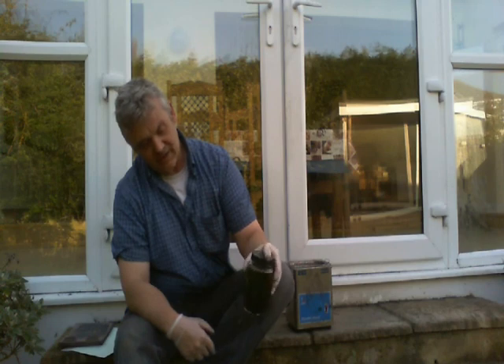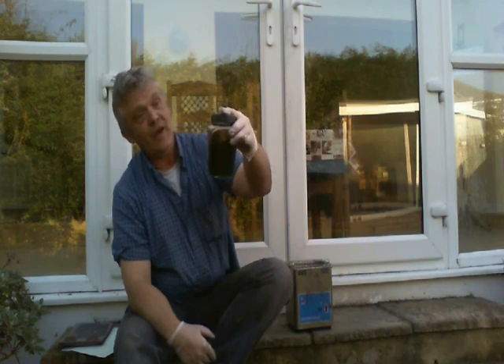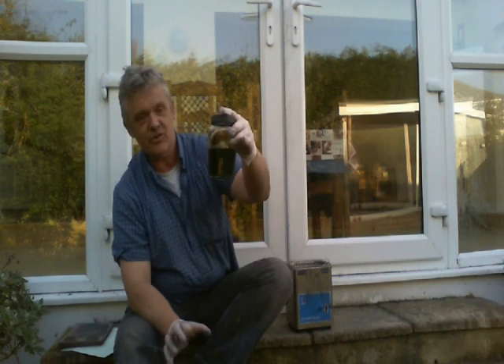All you do once you've added it is give it a little swirl around. There is absolutely nothing else to do — just stick it on a shelf. Now I said before 6 hours is wrong; you stick it on a shelf for 48 hours. So just put that away for 2 days and leave it.